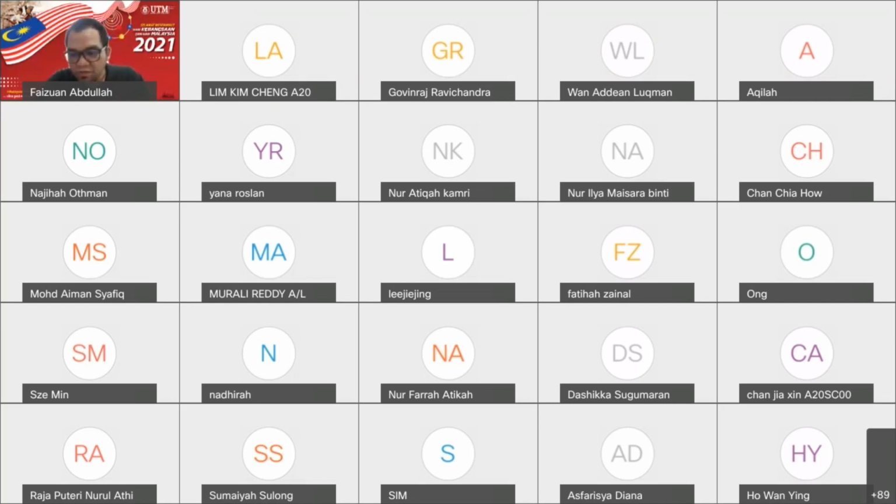So can we get the equation and R-square with the statistics part in the calculator? Yes, of course. If you know how to use the scientific calculator to get the R-square value, I think there is some method for that, but it's easier to use Excel.